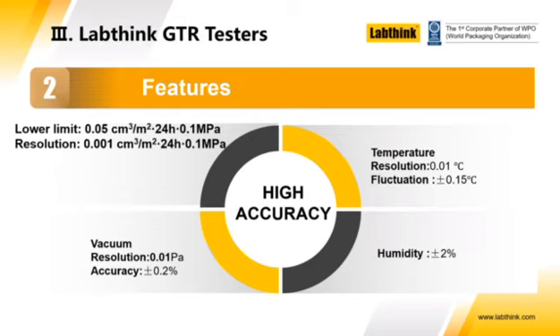Now, one thing you will note if you look into this for yourselves, or perhaps you already know it, is that the standard conditions for ASTM D1434 are for those of using a gas with 0% relative humidity in the system. In other words, the gas used or specified in 1434 is generally dry gas, and so there's no need for any humidification.